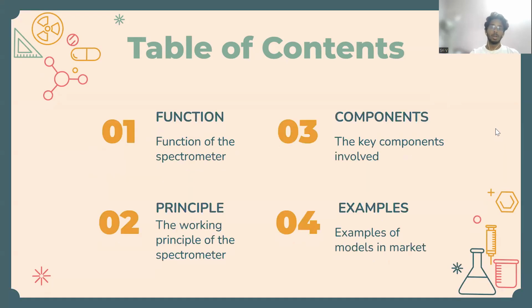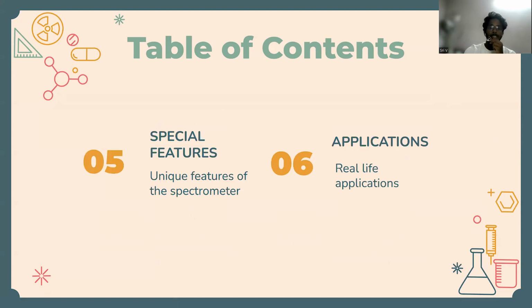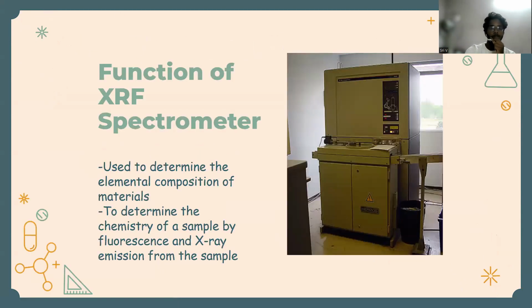So let's first look at the table of contents where I'll be explaining about the function of the spectrometer, the working principle of the spectrometer, the key components involved and the examples of models in market. So let's begin with the XRF spectrometer and its functions.